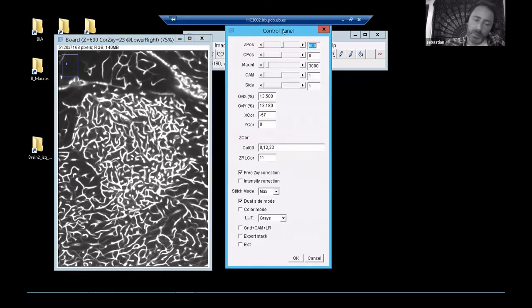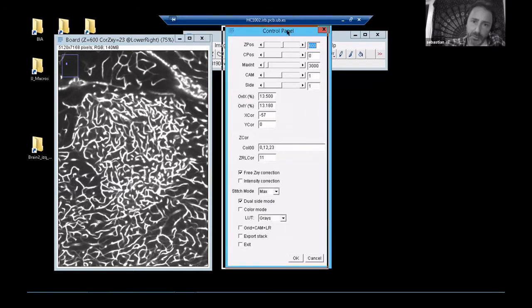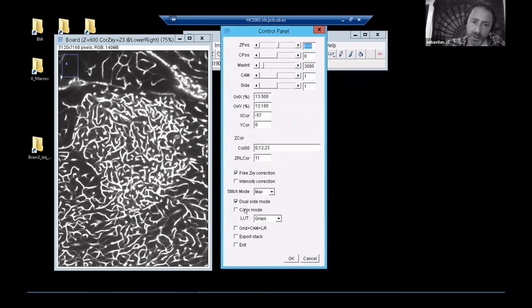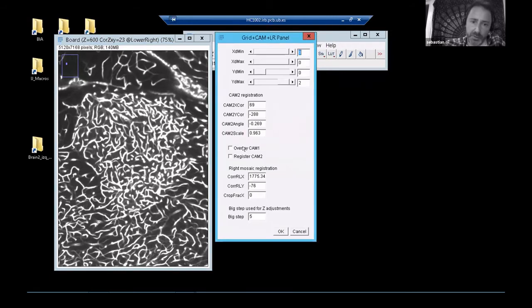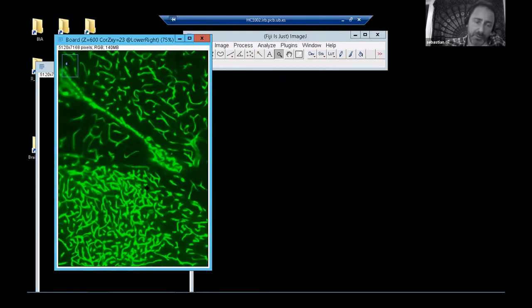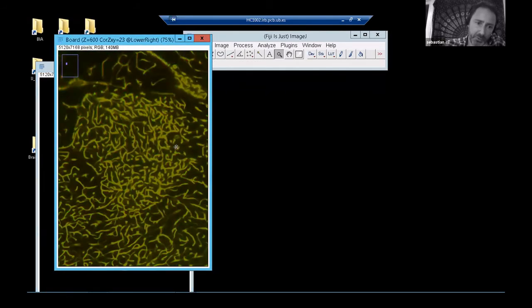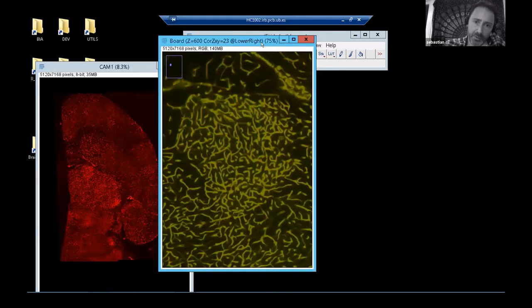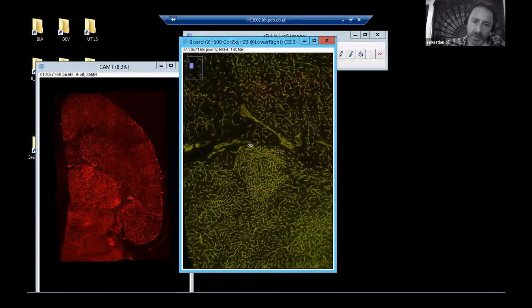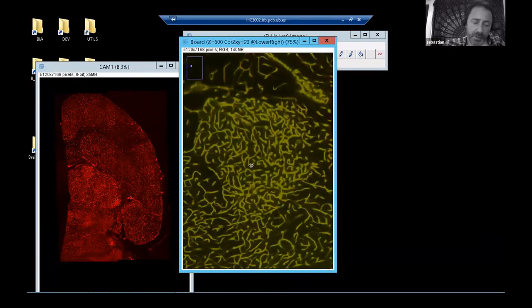The whole idea is to register the two cameras in the plane where you want to make the switch between both cameras. This is done with the same process: just point-click landmarks to find the proper transformation. Once the alignment is performed, you can check the translation, rotation, and scaling values. If properly aligned, you should see the two cameras blend to yellow. Then export the images, specifying at what slice to switch the camera — in this case at the middle, slice 600 — and the software automatically applies the registered transformation to all slices.